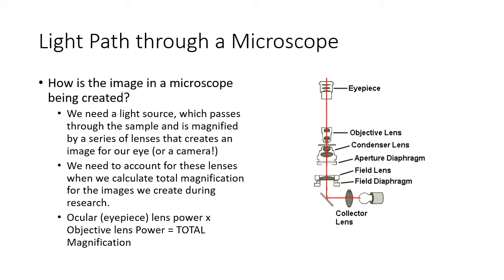And so here we have basically just a general schematic of the light path going through a microscope to generate an image.